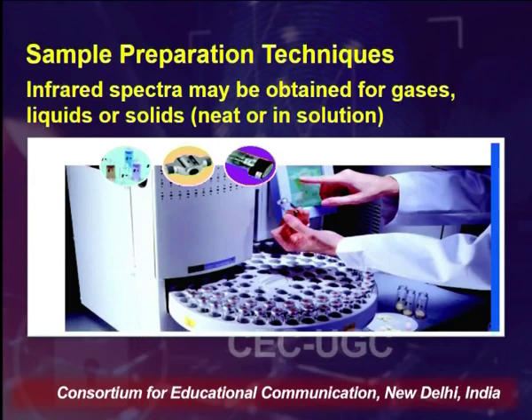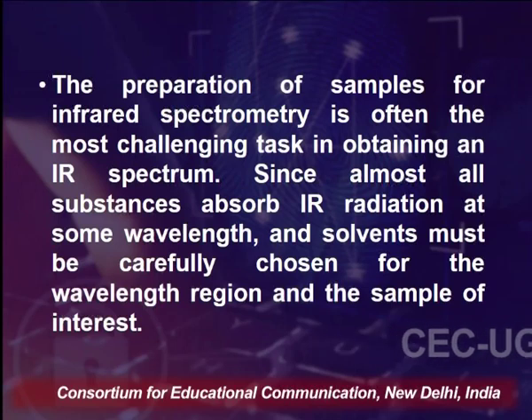If we have encountered a liquid sample, depending upon the concentration of the sample, we can use IR transparent window cells and analyze using that. And for the gases, we have specialized IR transparent chambers in which the gases are put, where the chambers are spacious and we can directly inject the gases, and they are airtight chambers so that the sample does not eject out. So let us talk about the preparation of the samples for IR spectroscopy.